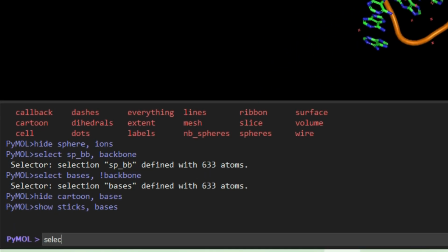using the following command: select upper, comma. We are selecting the nitrogen bases or the residues on the basis of their residue IDs. Therefore, the selection criteria in this case is residue IDs, which is shortly aliased as resi, and we will provide the number or the range of bases that we want to select. The upper part of our riboswitch consists of nitrogen bases starting from the 8th nucleotide to the 38th nucleotide. Therefore, we write the same as 8-38.